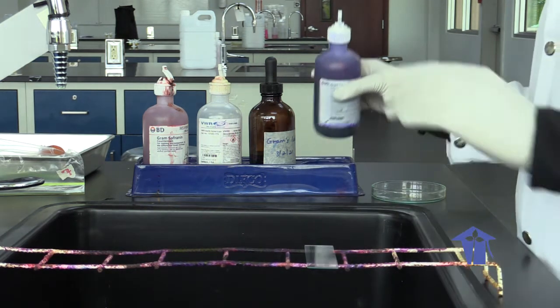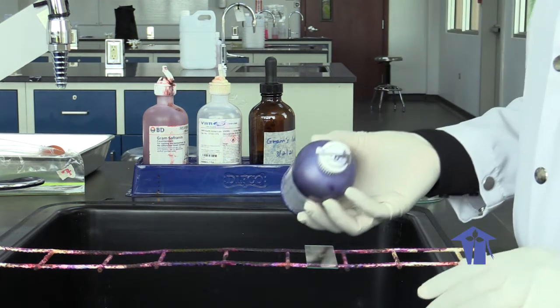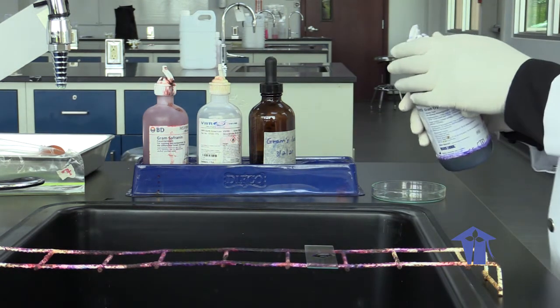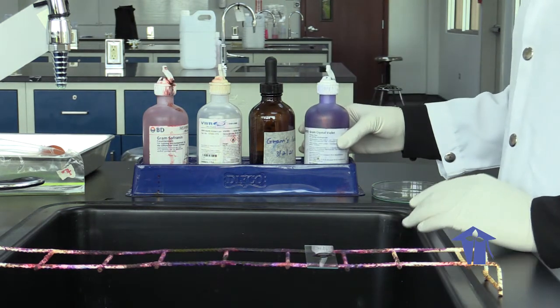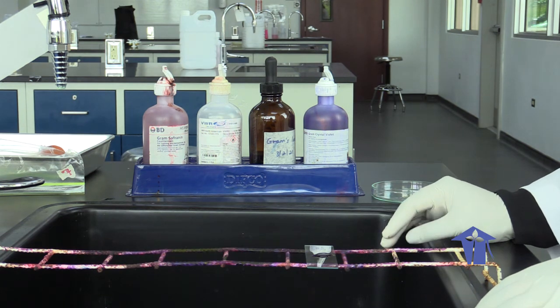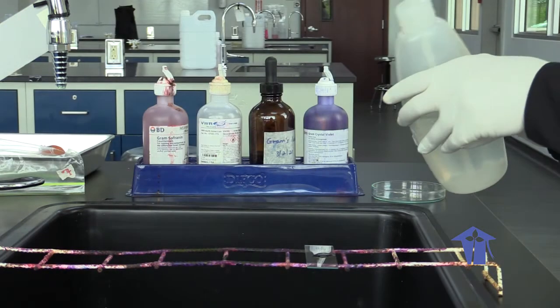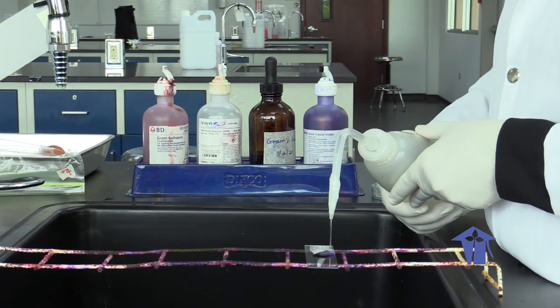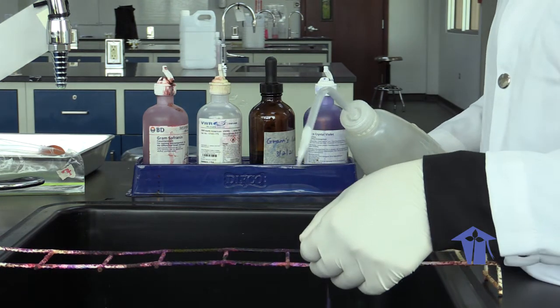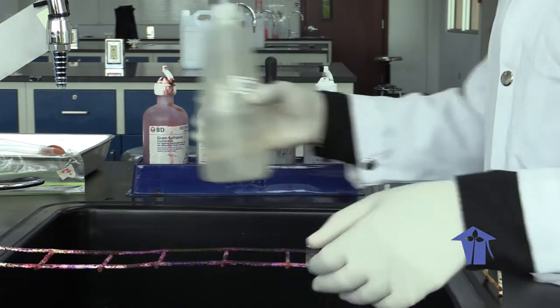The first stage of our Gram staining procedure is to apply crystal violet and let it stay for 20 seconds. So we ensure the entire sample has been covered and we allow it to stain for 20 seconds. After our 20 seconds has passed, we wash off our crystal violet stain for about 2 seconds. You can just tilt our slide to ensure all of that stain has been removed.